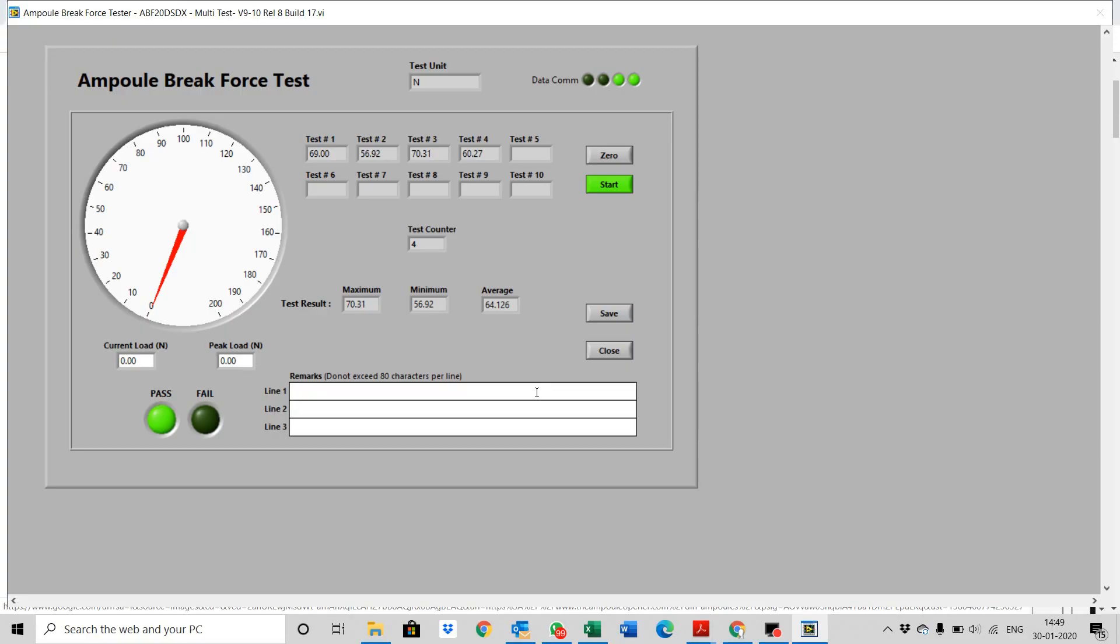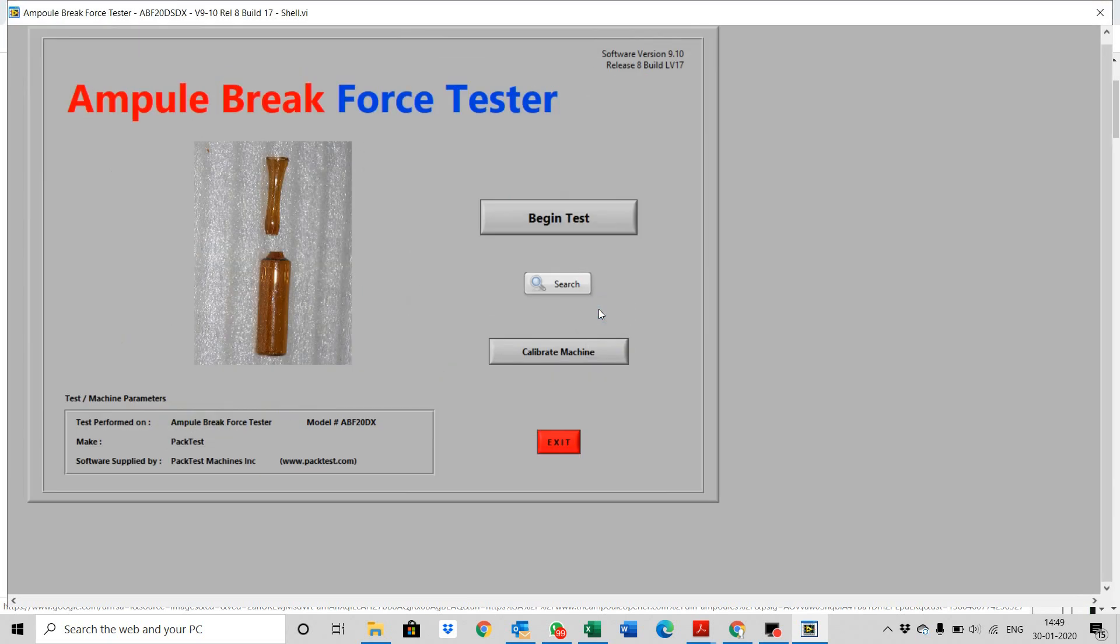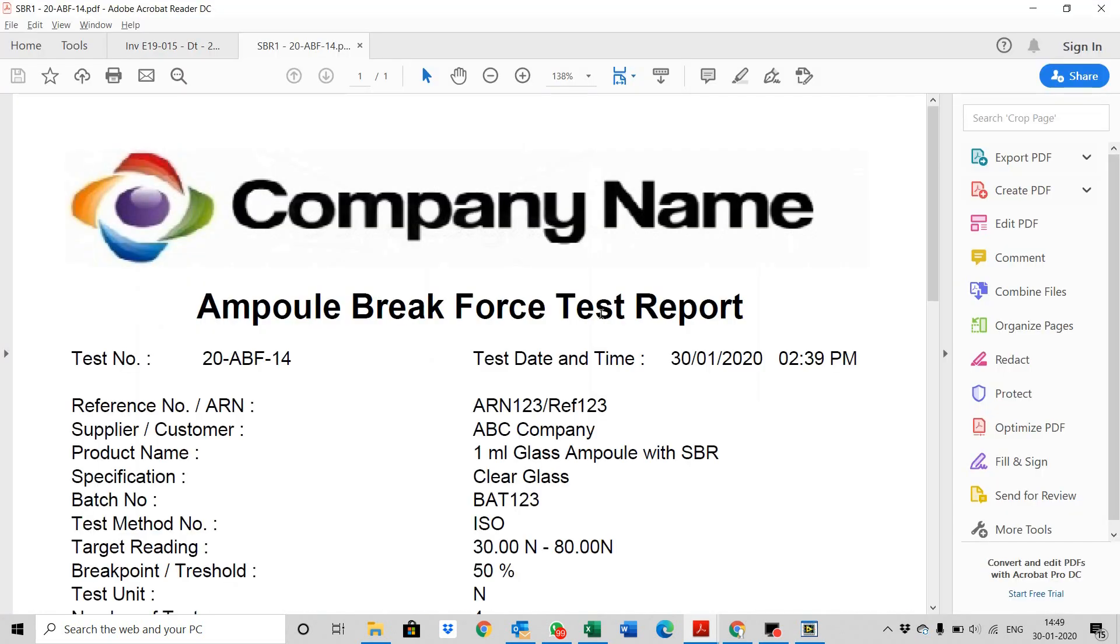Fill in remarks, if any. Then press save. The window will close and a PDF test report will be generated. Thank you.